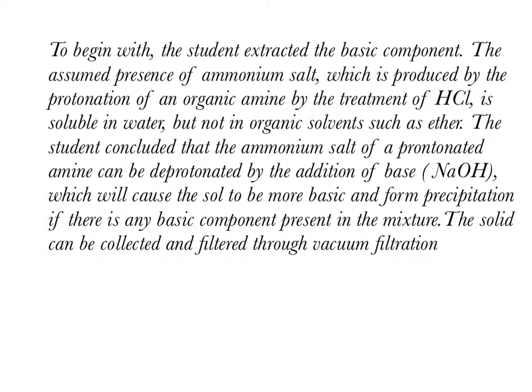To begin with, the student extracted the basic component. The assumed ammonium salt, which is produced by the protonation of an organic amine by treatment with HCl, is soluble in water but not in organic solvents such as ether. The student concluded that the ammonium salt of a protonated amine can be deprotonated by the addition of a base such as sodium hydroxide, which will make the solution more basic and form a precipitate if any basic component is present in the mixture. The solid can be collected by vacuum filtration.